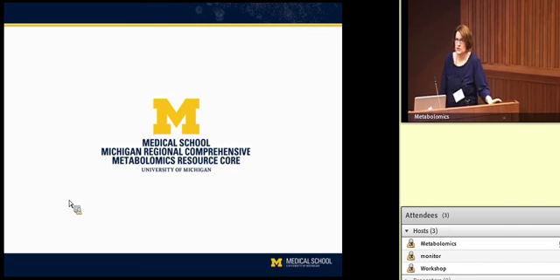The untargeted is just because of the way we report the data, and most people are interested in not just the named known compounds, but all the unknowns, which requires a lot more data analysis. You're kind of biting off a bit more to chew. With this, you may talk to me and we may go through that list of the hybrid, targeted, untargeted, and that may suit your needs. So like I said, I can send you the sample report and we can talk about that. That covers most of the metabolites you're interested in. So yeah, go ahead.